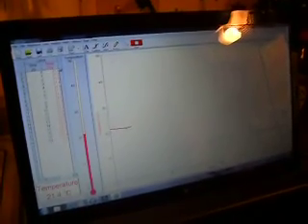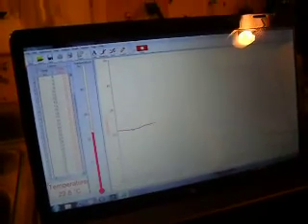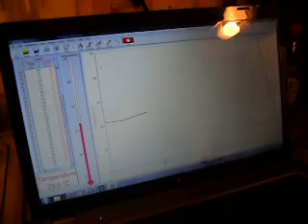212 degrees? What scale is that, Melissa? Fahrenheit. Good. What are we reading in? Celsius. Good. Okay. So that's a little different than the Fahrenheit scale. What temperature does water boil in the Celsius scale? 100 degrees. Okay. So what we can do, what's kind of cool, is we can stretch our graph down so we can see all the way up to 100 degrees.